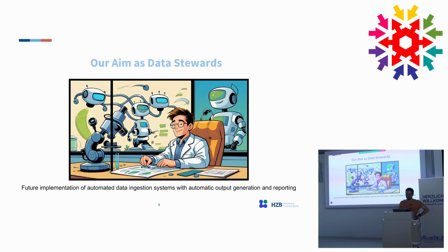So in the future, we want to make everything automatized. We have been working a little bit with this, especially with newer equipment. We are asking now that they add a NOMAD button so that people can put their credentials and they can immediately upload their data after they have measured something. We are moving there. I don't have any examples yet because the equipment has not been delivered, but in principle, everything should be working for this particular equipment.